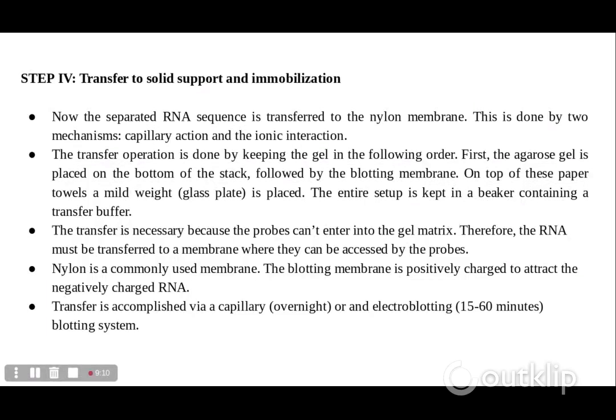Now, step 4 is a transfer to a solid support and immobilization. The separated RNA sequence is transferred to the nylon membrane. This is done by two mechanisms, that is capillary action and the ionic interaction. So, the transfer operation is done by keeping the gel in the following order.